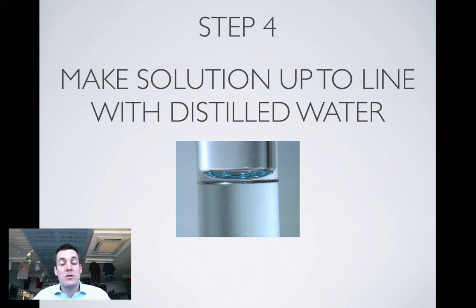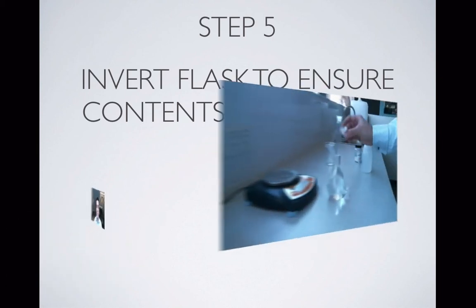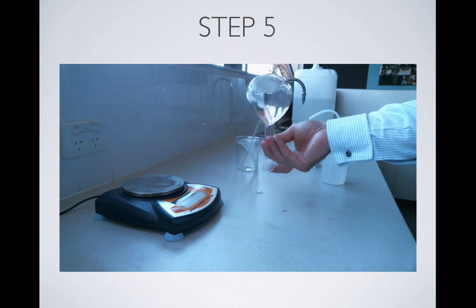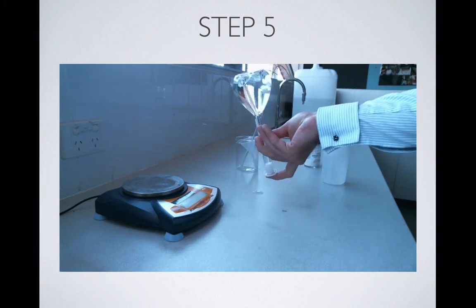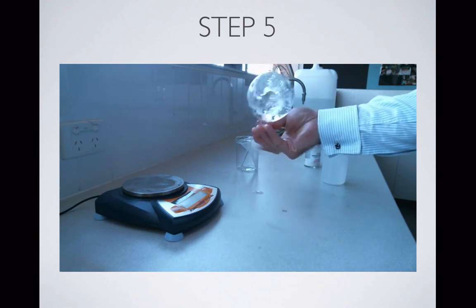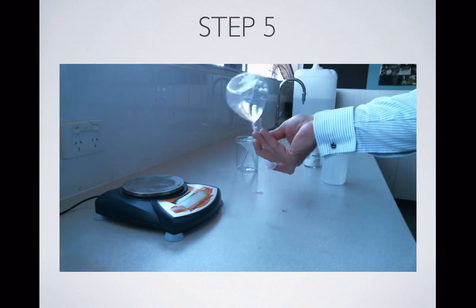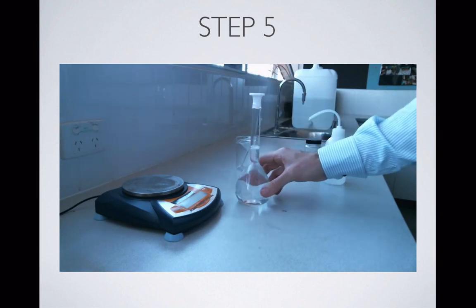And then the last stage, which is actually a lot more important than some people give it credit for, is to invert the flask and make sure that the contents are fully mixed. The reason this is a really important step is because the solution doesn't mix very well whilst you're doing your rinsing. So put the stopper on, hold it in with your finger, and turn the flask right upside down a few times and give it a swirl while it's upside down. Shaking the flask up and down does not do a good job of mixing.